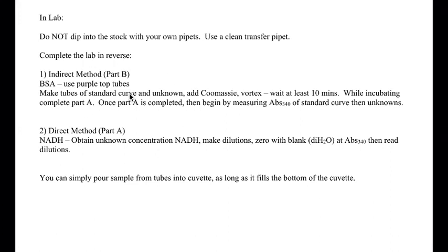Now I'm going to give you a few hints on completing the lab in a timely fashion. Complete it in reverse. So the indirect method, part B, where you have your BSA and you have to add your Bradford reagent, it's going to have to incubate with that Bradford reagent for 10 minutes, right? And so while that's incubating, if you start on BSA, let it incubate for 10 minutes. And while that incubation is happening, go ahead and work on part A. Then once part A is completed, then go back and measure your BSA. So it'll just make your life a little bit easier.